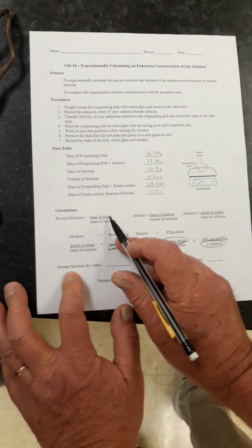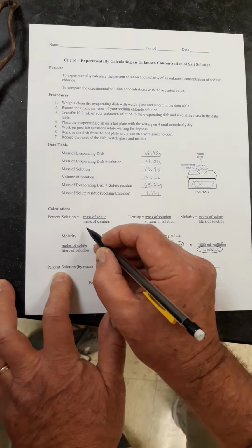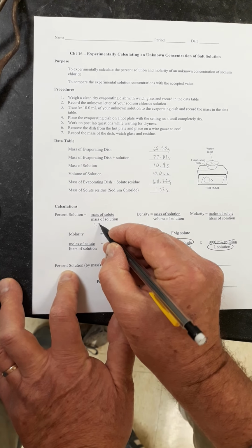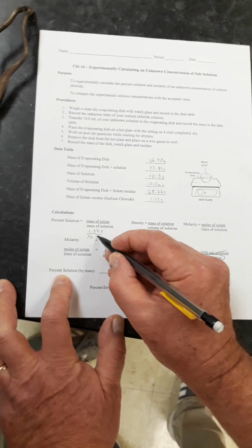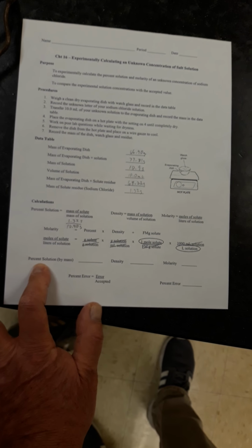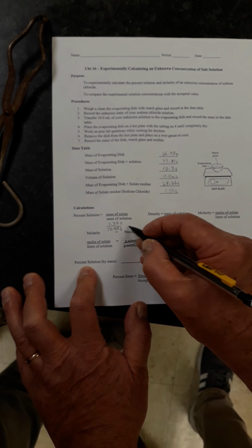All right, so here are the calculations. Percent solution is mass of solute over mass of solution. Pretty easy calculation. The mass of the solute is 1.32. The mass of the solution, 10.90. Divide those. 1.32 divided by 10.9, 12.1 percent.